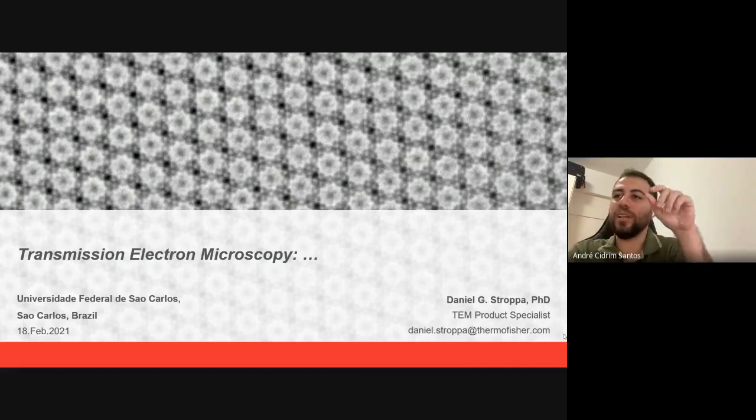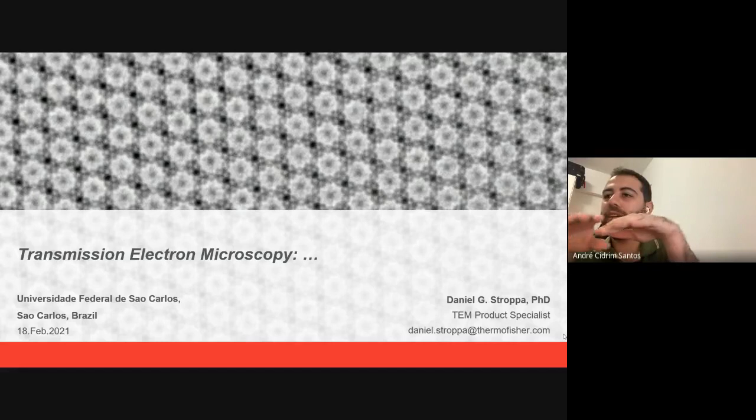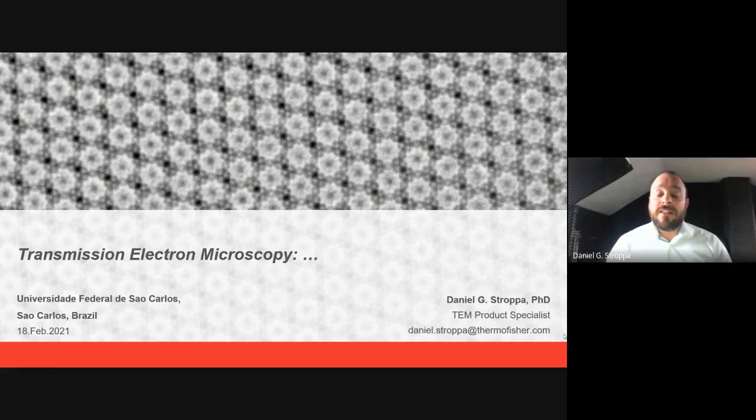So if you think that you have an electron wave propagating slice by slice through the sample, that's the way that we calculate and simulate images, but then the physics or the reality is that your shining electrons are going through and you're capturing. Oh, I see. So it's a way just to try to understand the image formation. So what you get in the end is that you set up the wave before the sample and you capture what's after. That's okay. I see.